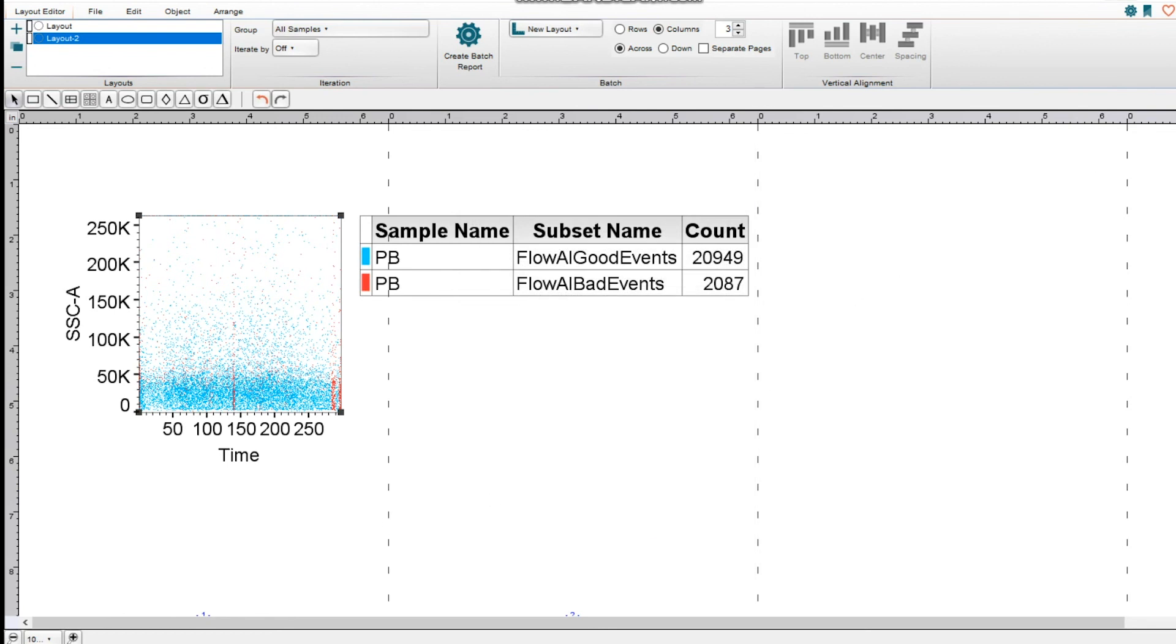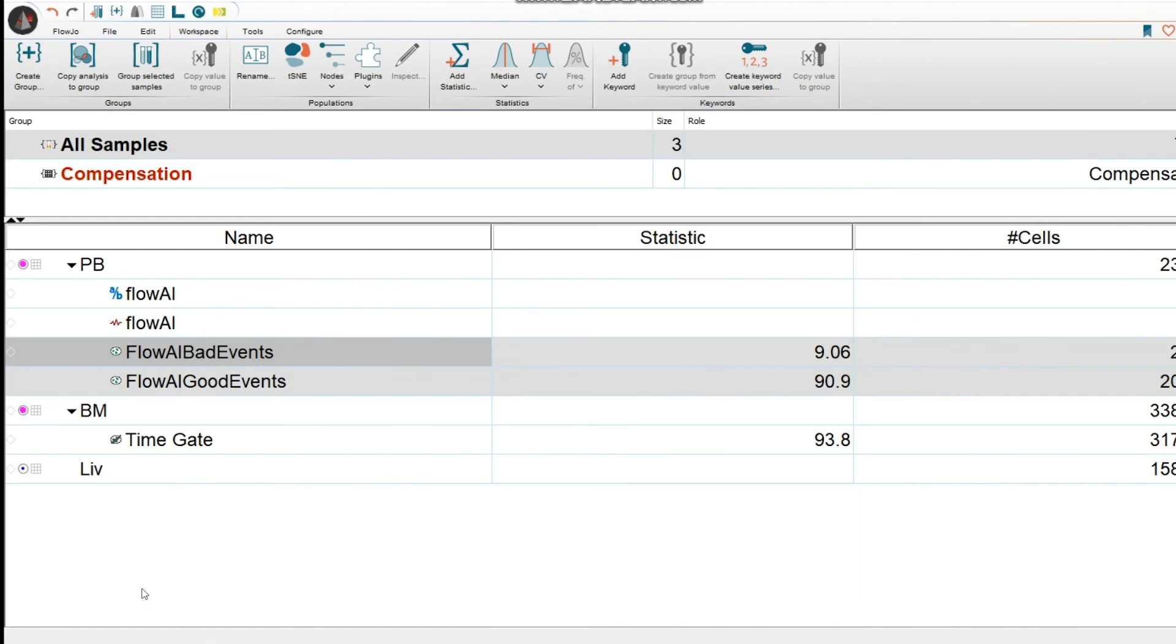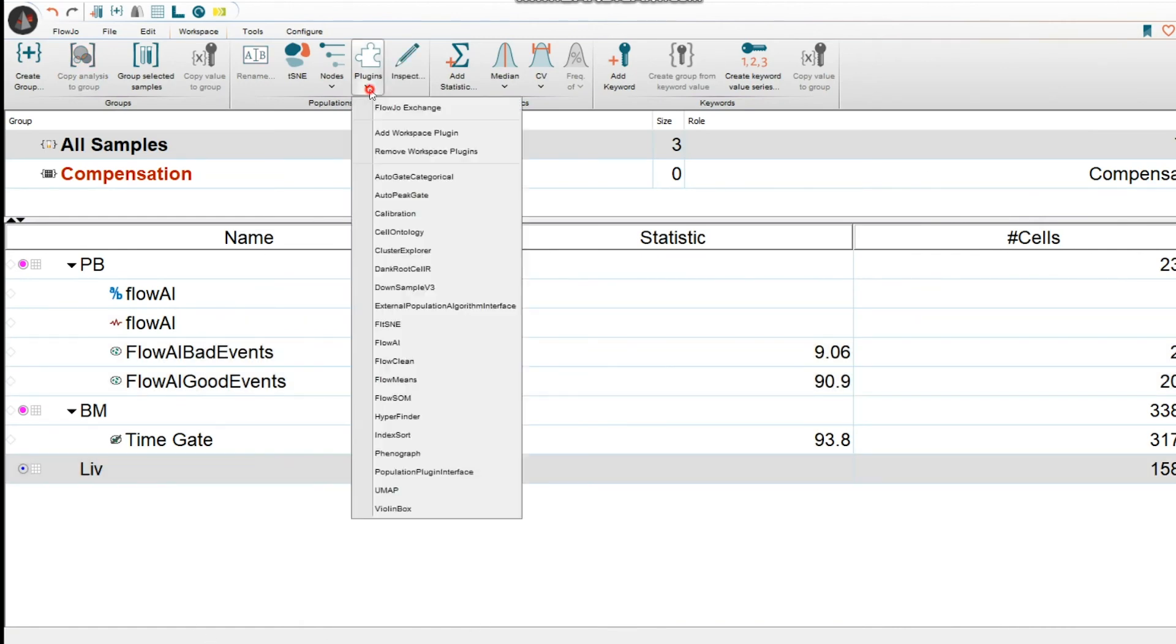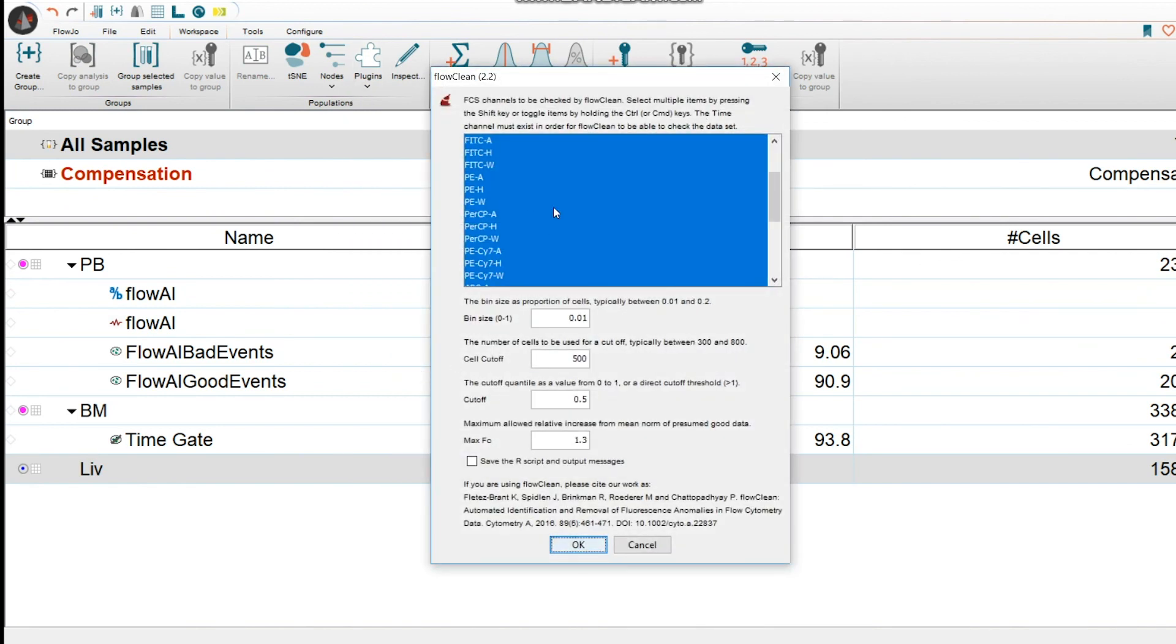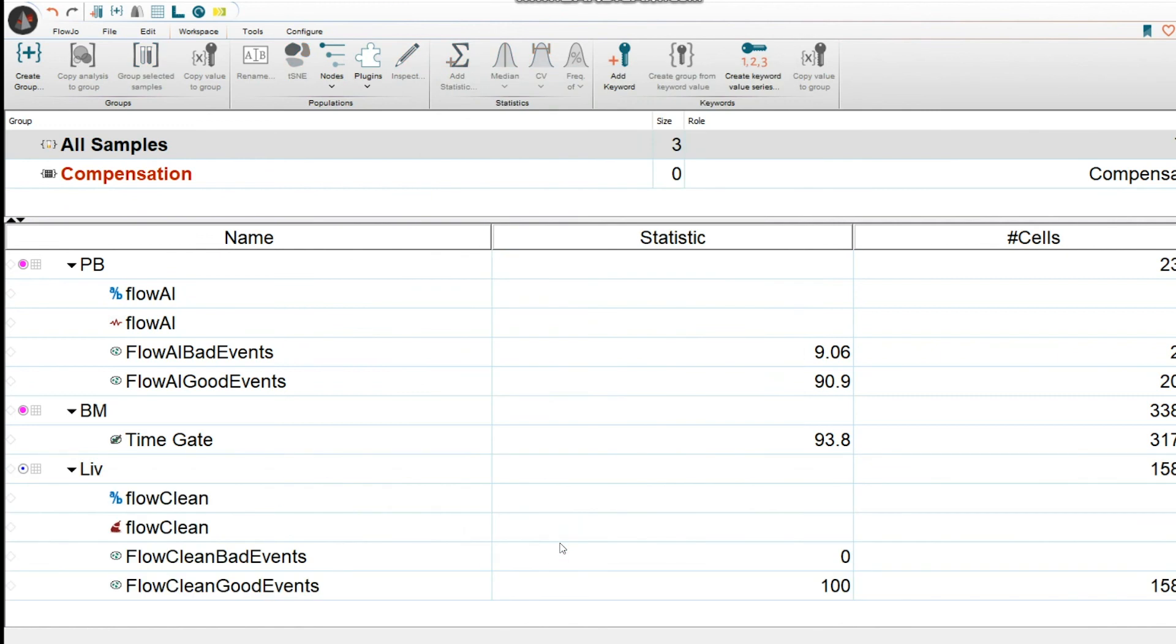All right. Next, let's see how we would do FlowClean. So let's select the sample. You would then go to plugins, select FlowClean, select again all the non-compensated parameters, as well as selecting time. Again, I would save the R script, and you would just click on OK. And as you can see here, then you get an output. There's their different algorithms, so they check for different things.